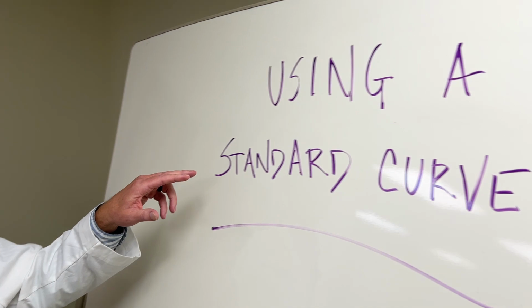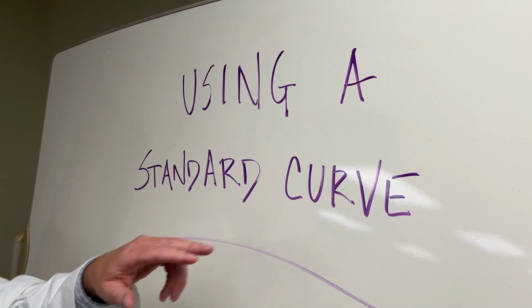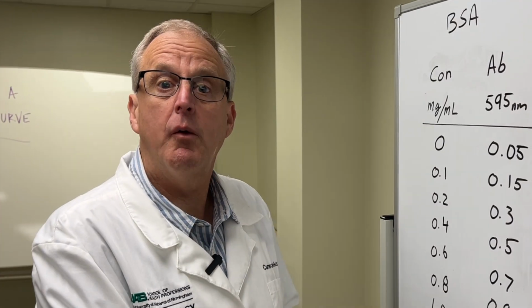Have you ever been working in the lab isolating proteins and you wondered, what is my protein concentration? Well, we're going to solve that problem right now by using our handy dandy standard curve. Meet me over at the board, please. All right, here we are. How are we going to set this up?